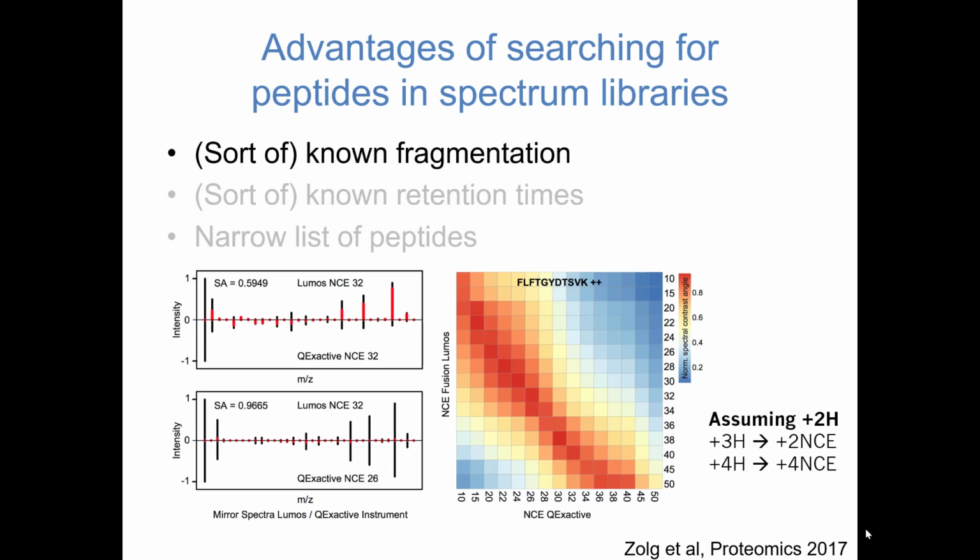But then trying to use that spectrum as information for where you call that peptide will be completely wrong, right? You'll call the different fragment ions as being more intense, and you'll actively look for them at a different intensity level. And so your scoring patterns, which are mostly going to go after those delta intensities, are just not going to be as precise. Does that make sense?